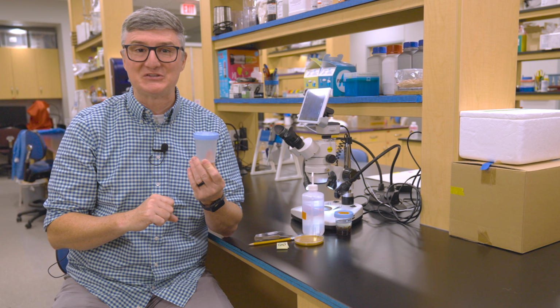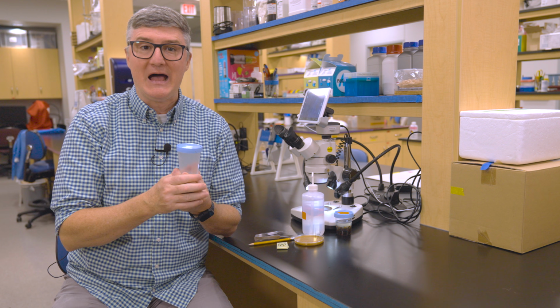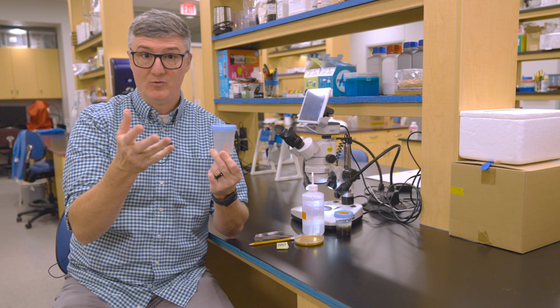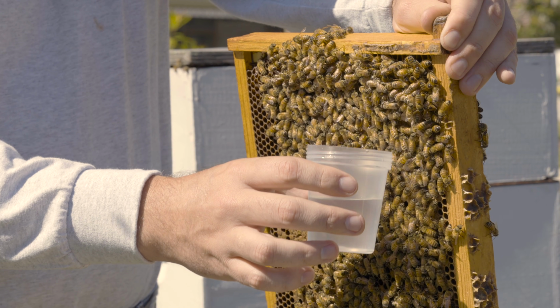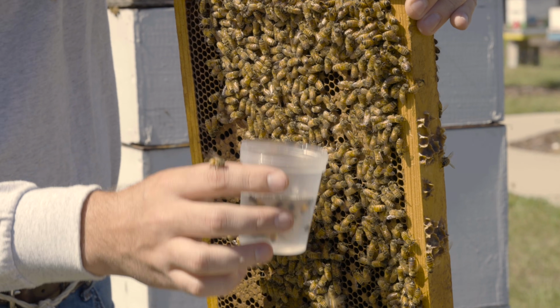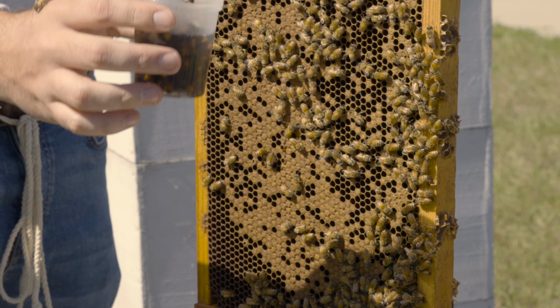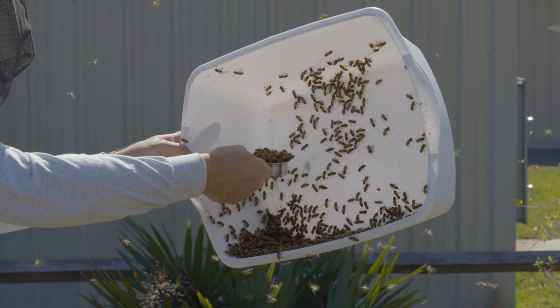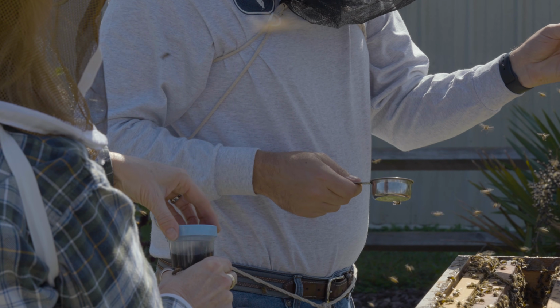A lot of people don't have access to pure ethanol or high concentrations of ethanol like we do here in the lab. So don't worry, isopropyl alcohol or rubbing alcohol will work well. You can half fill this container with rubbing alcohol. Then you can go to your colony and collect bees off the ground, get bees from that net, or go to those outer frames and rub that open container down the sides of the frames, and that will cause bees to fall into that isopropyl alcohol. Once you have enough bees, somewhere in the neighborhood of about 50 or so, you can return the lid to the container and take that container of bees with you back to wherever you're going to do the dissections.